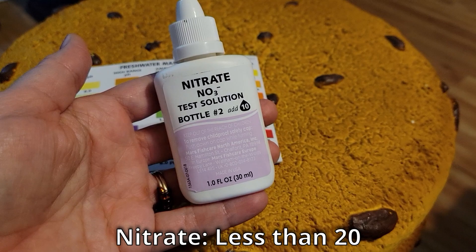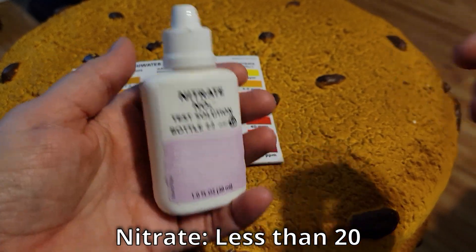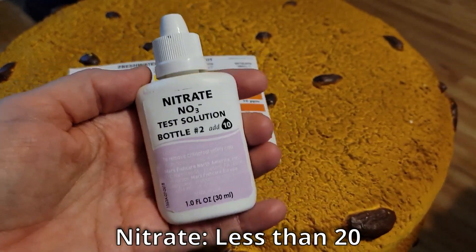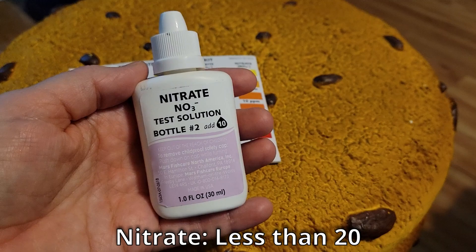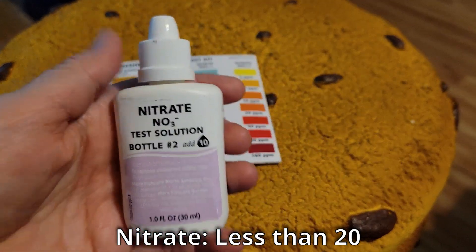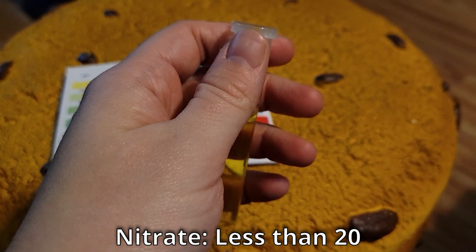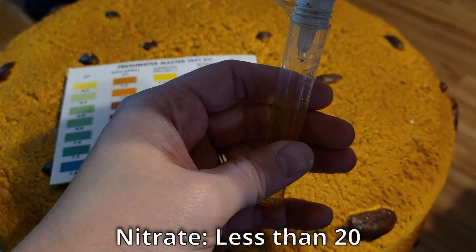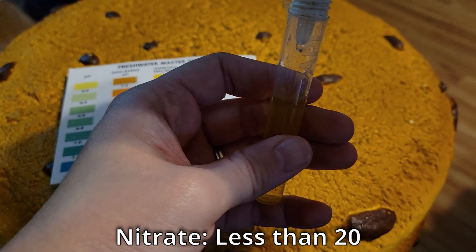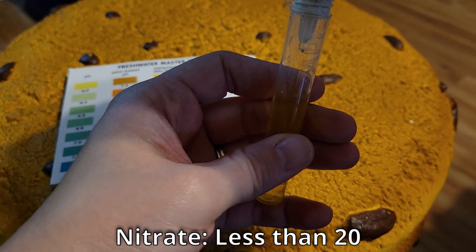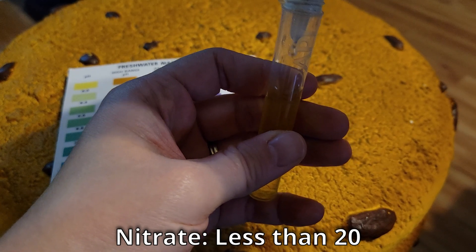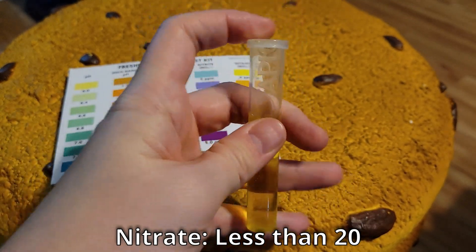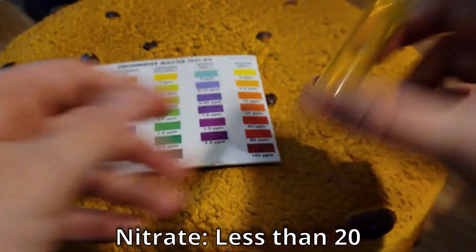For bottle two, before you put your drops in, you have to shake this bottle for 30 seconds. When I'm doing this test, I will use the stopwatch on my phone and time it for 30 seconds. After it's shaken up, you add your 10 drops to the test tube and then you shake the test tube for a full minute. Again, I use my stopwatch and time it for a minute and then you wait five minutes for the test to develop.